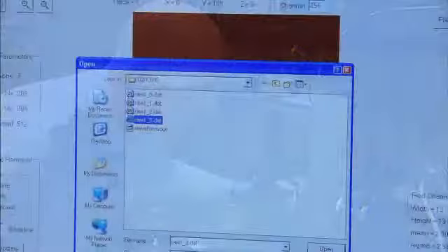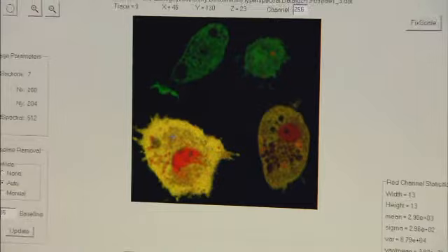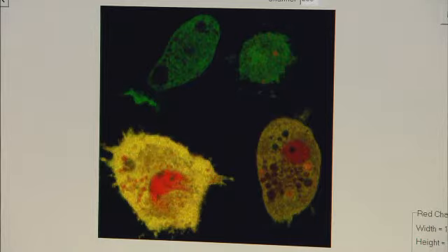This is the data file that we just acquired. Oh wow, look at that. That's pretty. That is awesome. So we can see in this cell, we can see both GFP signature and the Cherry signature.